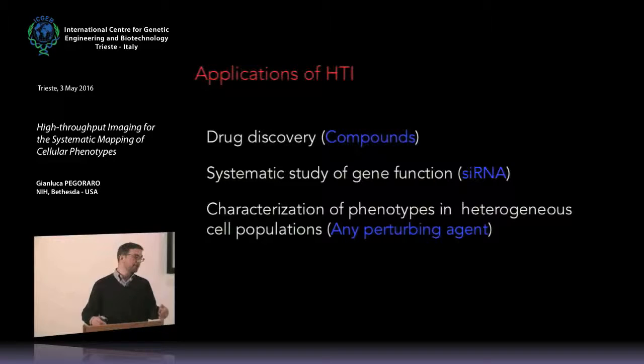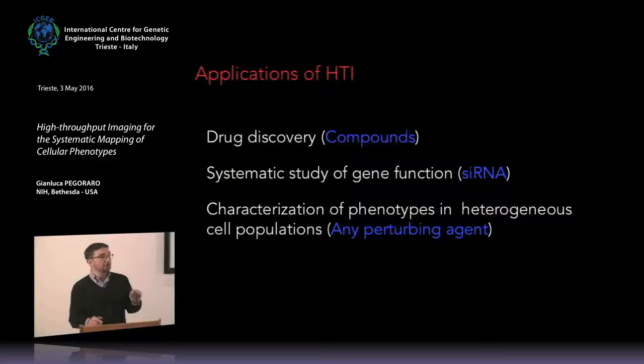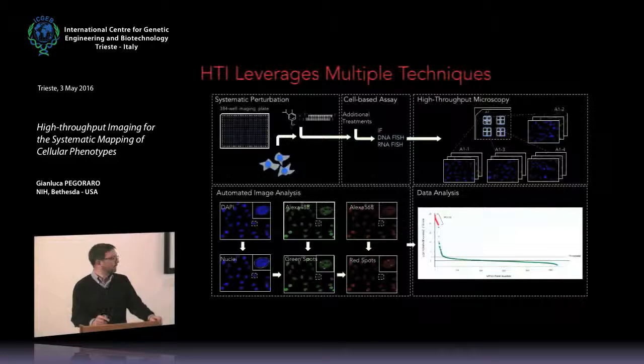But then high-throughput imaging is also now used more and more, not just to test a large number of experimental treatments to identify a few that might have a biological activity, but rather to look, in a small number of experiments, at a large number of cells. And this is going to be particularly interesting and useful for looking at extremely rare but biologically important events.